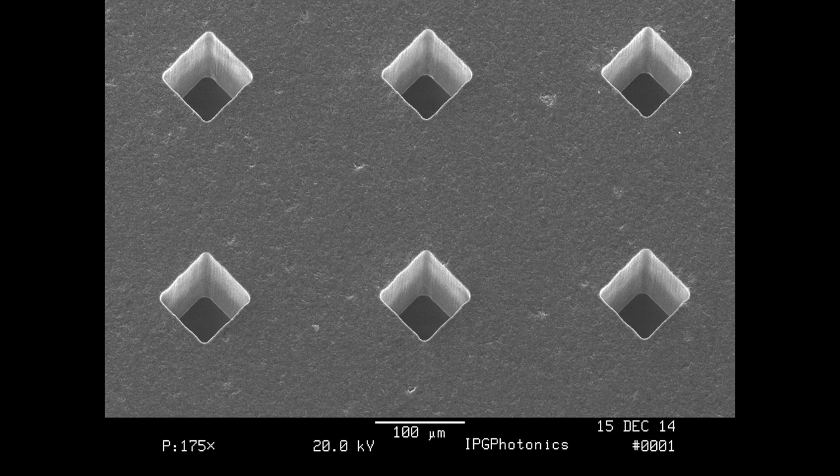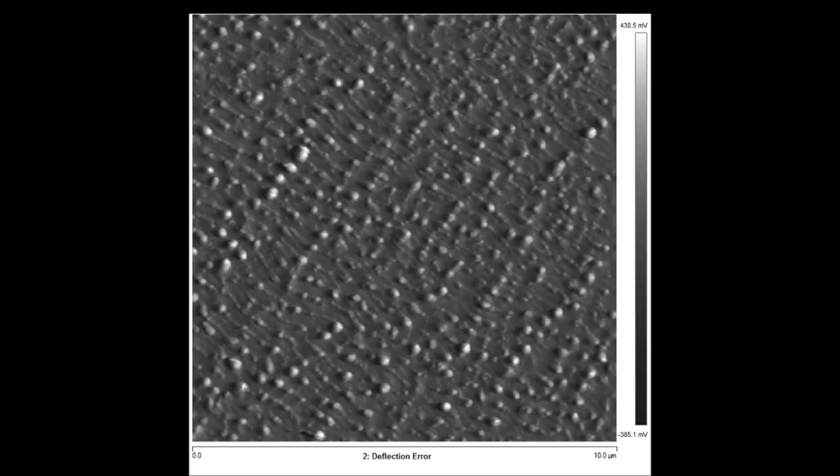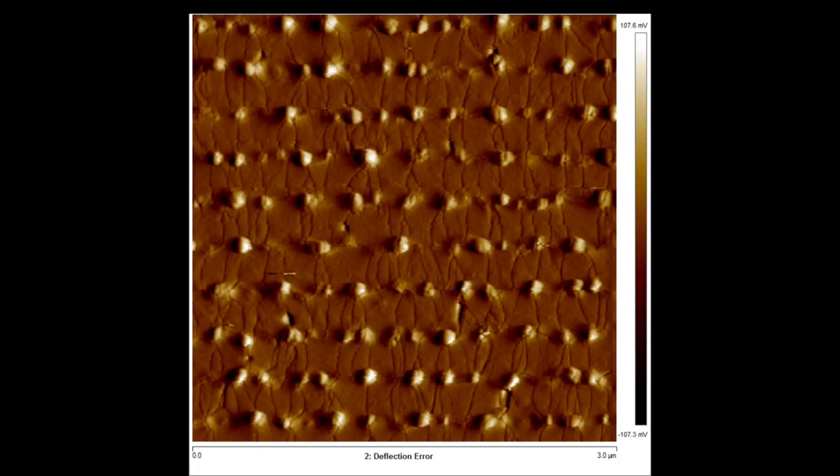SEM is used when you really care about high depth of focus on the sample and want to check parts in depth, while an AFM allows you to inspect parts with really high contrast.